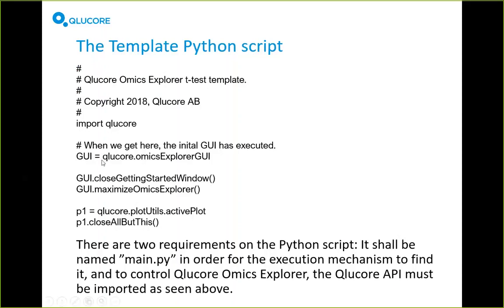This is an interactive template with a user interface specified by the configuration file. It has widgets named AnnotationDropDown, GroupDropDown, DirectionDropDown, and QValueSpinner. I want to access the values from those and use them in execution. So I get the annotation selected by the user from the AnnotationDropDown widget, the annotation value from GroupDropDown, the direction of the test from DirectionDropDown, and the Q-value from QValueSpinner. The configuration file required a dataset to be open.